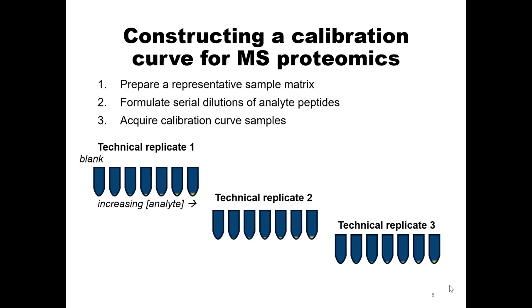Anybody else get burned by calibration curves before? Yes. Anything in particular? The same thing? Well, actually, I ran out of matrix. Perfect. Yes. Step 1, making sure you have enough matrix, is another. Having enough matrix in step 1 is definitely important.